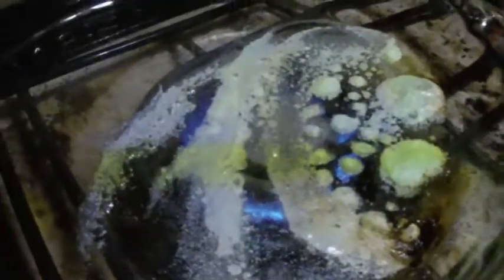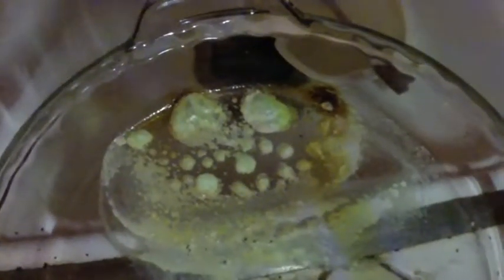Hi guys, let's play Guess the Alkaloid. Oh, I burned it. Yeah, I burned it a little bit.